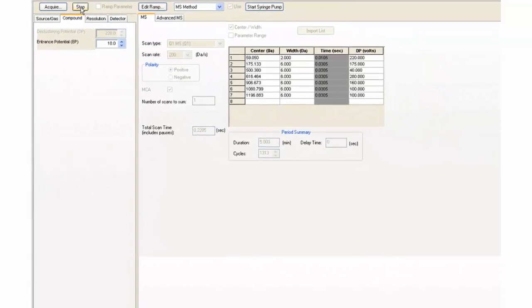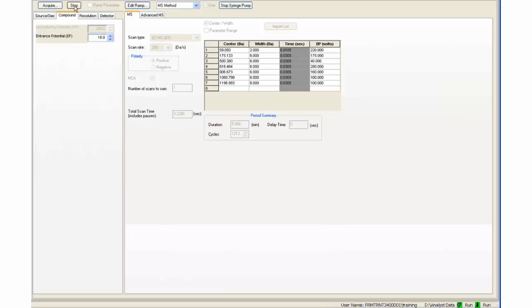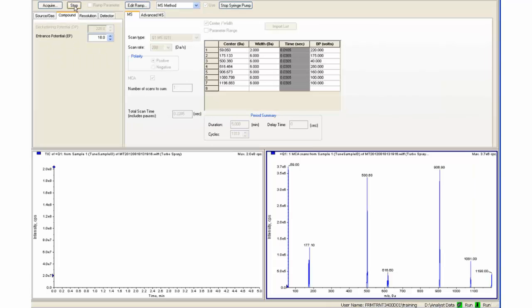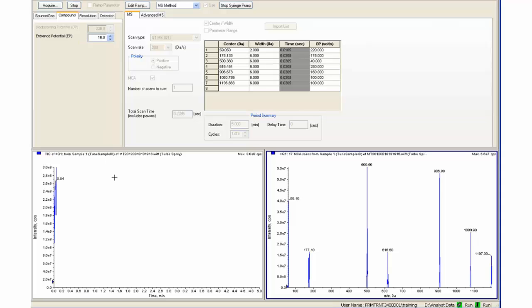Two panes will open. On the left side is the TIC, total ion counts, and on the right is the spectrum being generated in real time.